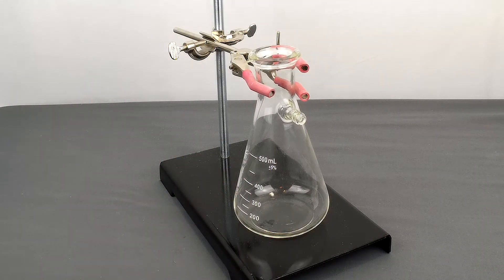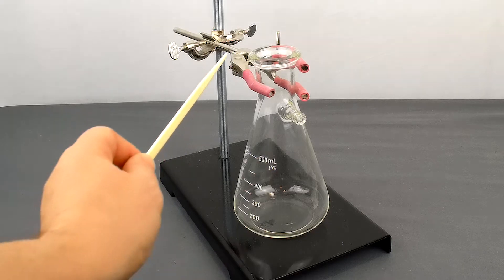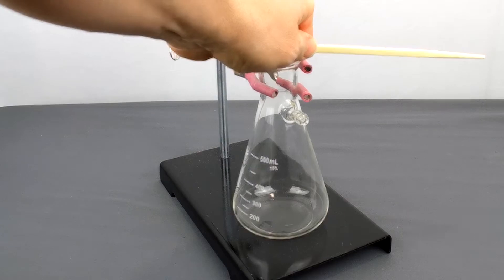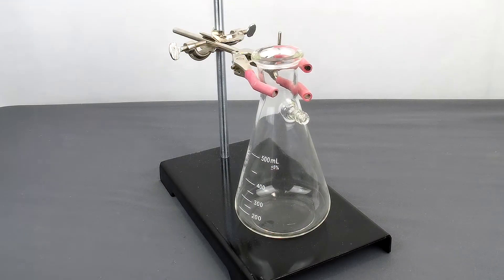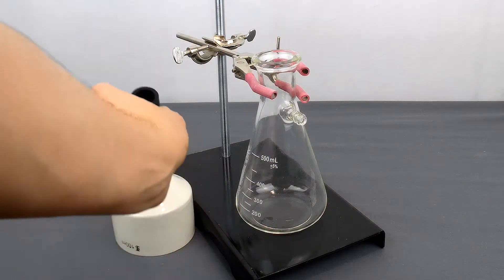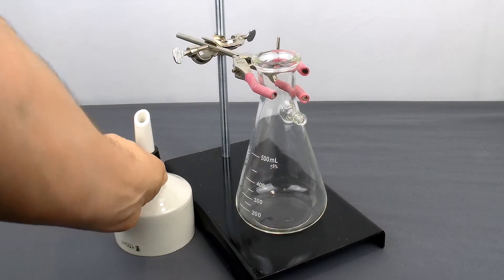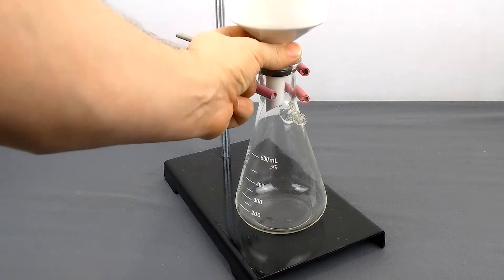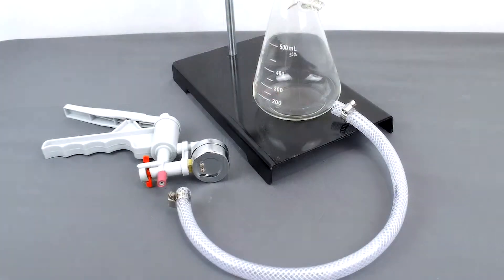The setup is very straightforward. We recommend a heavy support stand and a three-finger flask clamp just to hold the apparatus stable. When you place the Buchner funnel on top, the next thing you do is place the rubber stopper on the Buchner funnel and then just set it on top securely.